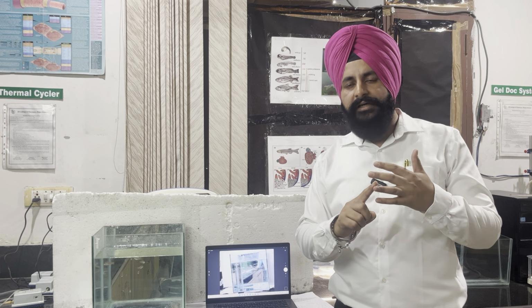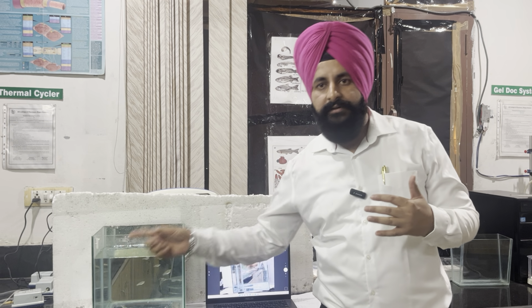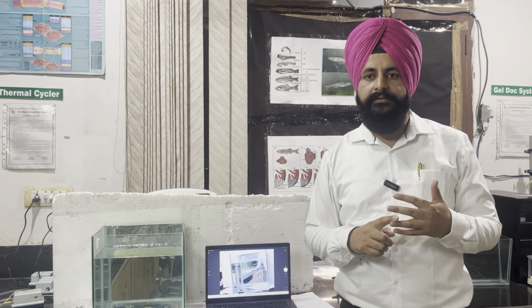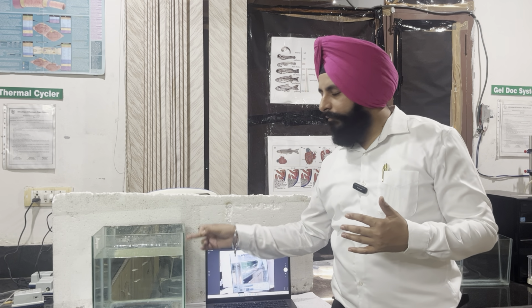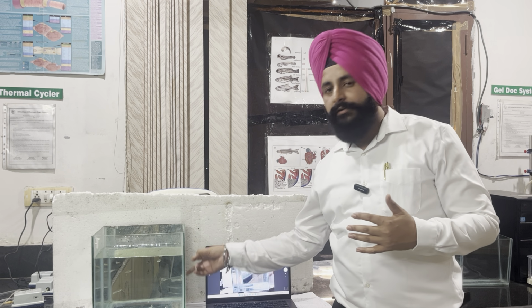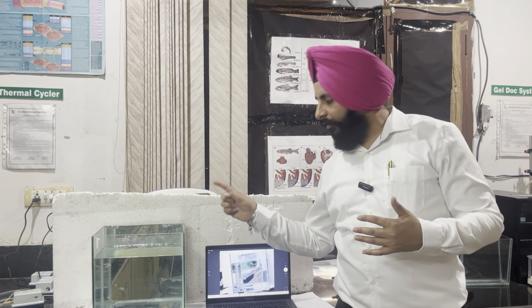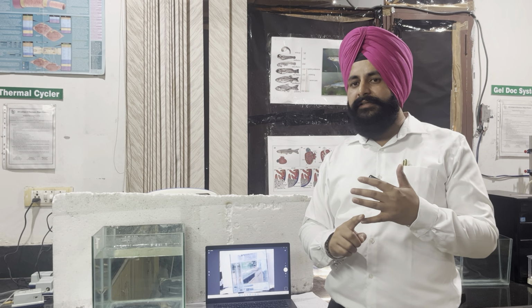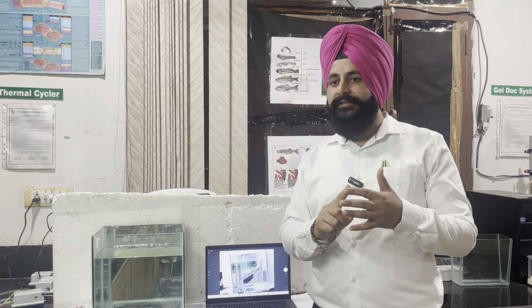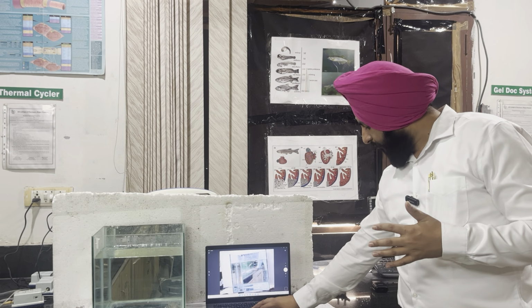The second thing, you will find how many times a fish strikes against this particular wall of the apparatus. The third thing, how many times the fish moves up and down along the wall of the apparatus. If the fish is moving fast along the wall of the apparatus, this is a sign of anxiety. The fourth thing you can see is that the fish will not take in food. This is the fourth sign.